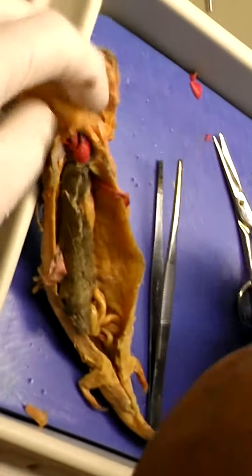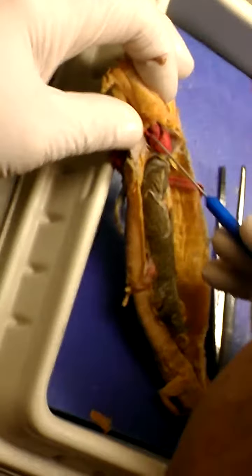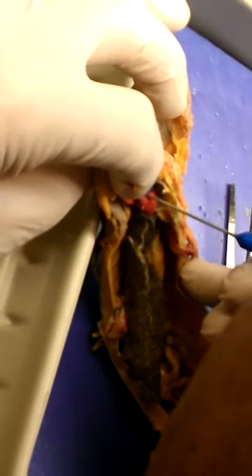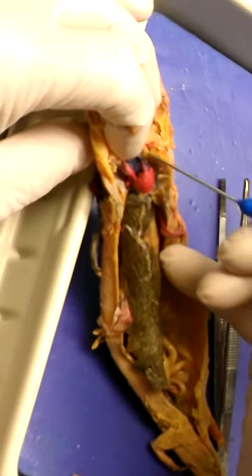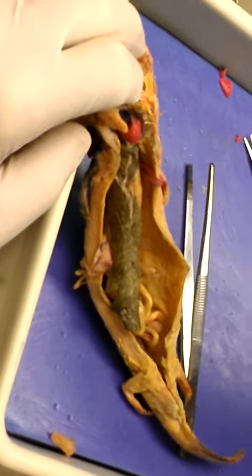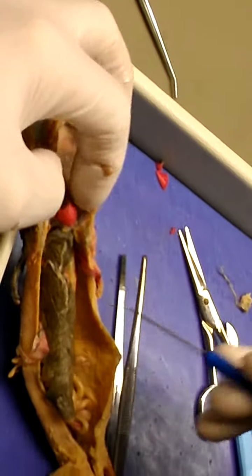Okay? So now when I pull this back like this, what I find is that I have a ventricle here, and I have an aorta leaving right here, and I have feeding into the heart from the vena cava here, in through the vena cava, into the heart, out through the aorta, out through the gills, through the rest of the body. Remember, this is a salamander. It doesn't have a four-chambered heart, right? Okay, so that structure is okay right there.